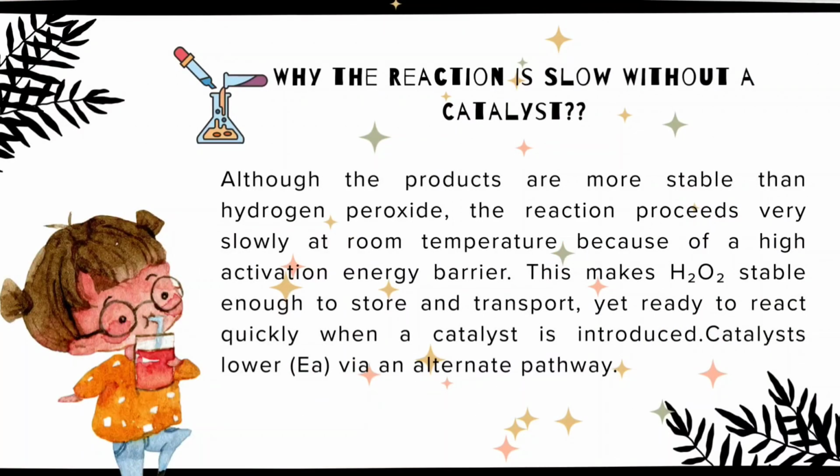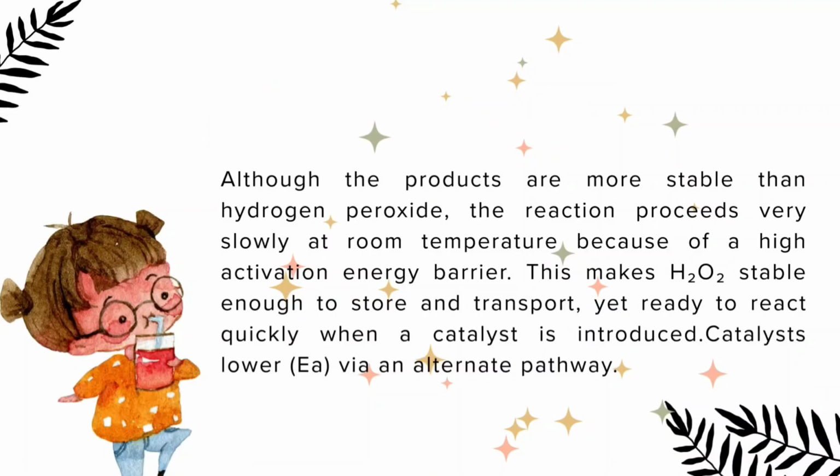However, the reaction proceeds slowly at room temperature due to a high activation energy. When a catalyst is introduced, the activation energy is reduced, allowing the reaction to occur much faster.